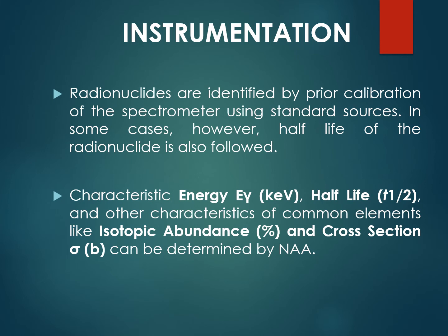If they have a very good half-life period, or we can say a high half-life time, then they can be efficiently and conveniently determined by using these techniques. So different parameters are involved in the determination of different substances. Like we have characteristic energy, most importantly the energy used for the determination of substances, or for the detection of different elements, which is the gamma ray energy.